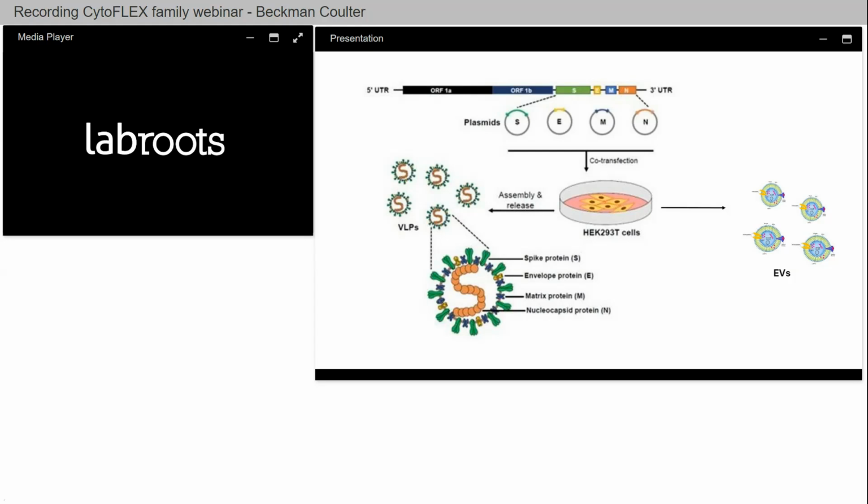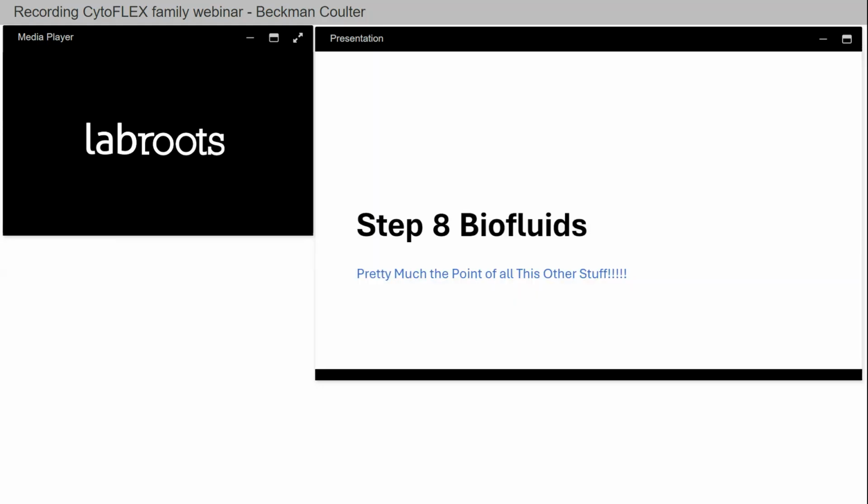Also, in these instances, it shows a little bit of what we were talking about with problems. Contaminants, right? These two share density, share size. You can't separate them. You can get rid of the cellular debris and other things that may happen in these cultures, but you can't get rid of the two things that are very, very similar in all their characteristics.